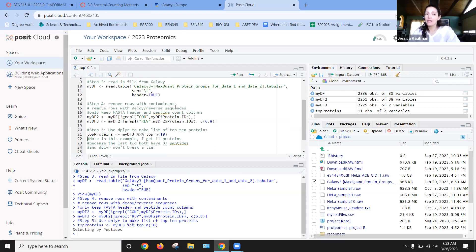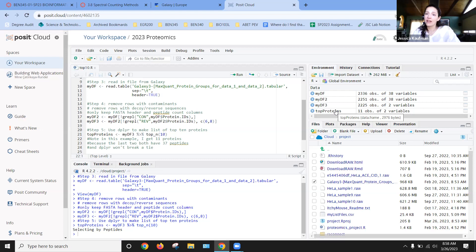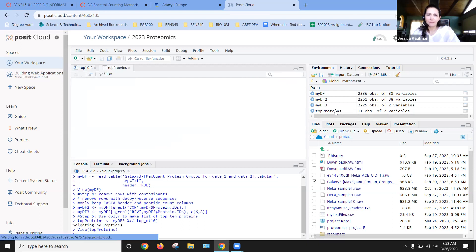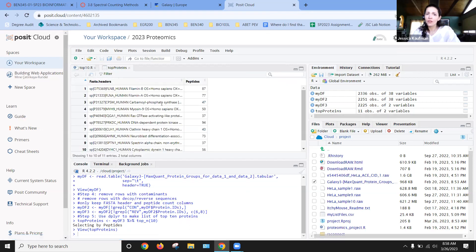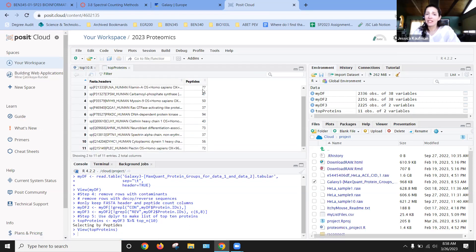I'm ready to look for the top proteins. So what are the most abundant proteins in this sample? And when I run this, I get 11 proteins.